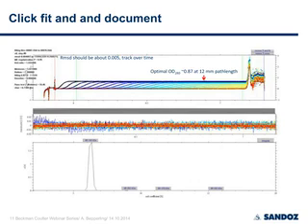For the OD, there's plenty of literature available discussing the optimal OD. In theory it's quite simple. The Eulerian absorbance should be 2, so I over I0, and the logarithm of it should be 2. So this means the decadic logarithm of 2, which is 0.8686 and so on.